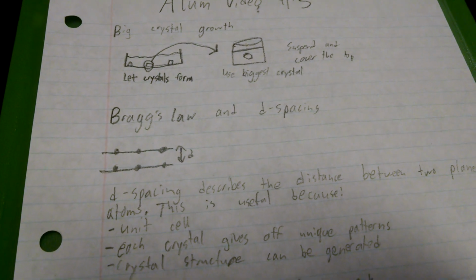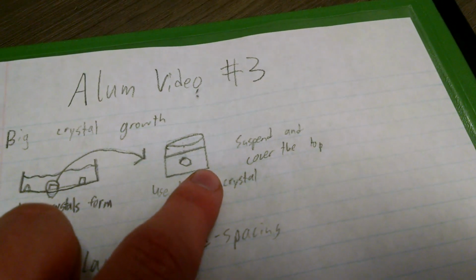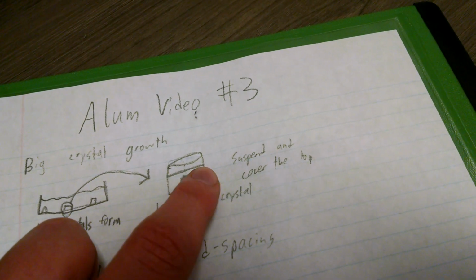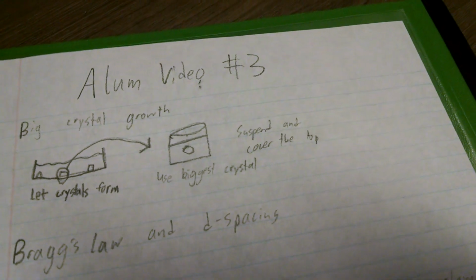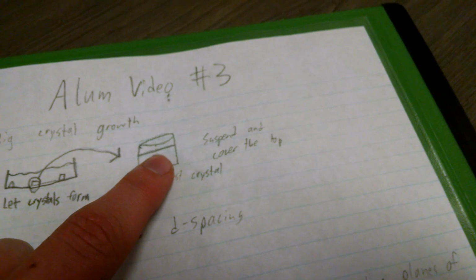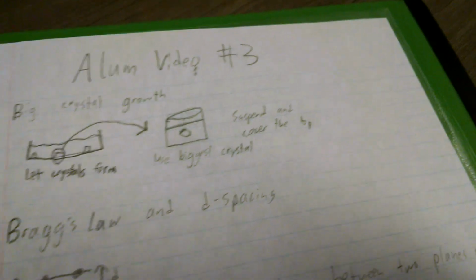So the way you do that is you take this crystal, you put it in the solution. You want it to not be touching the walls, so you'd hang it down so it wouldn't have any other places, any other nucleation sites where crystals would form. They'd all just form on this crystal. Then you would get a nice alum solution. You put the biggest of your small crystals in the solution, and then all the alum in solution would cling onto it and cause the crystal to grow larger and be rather high quality.